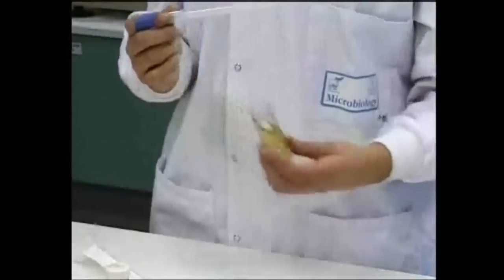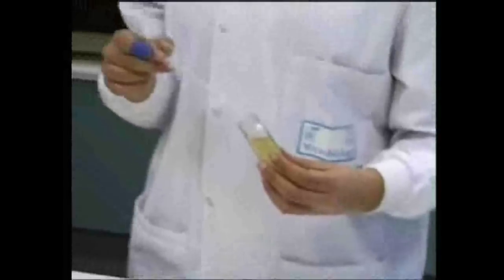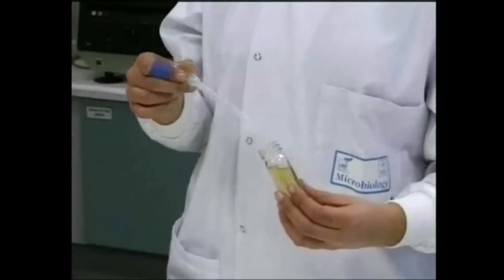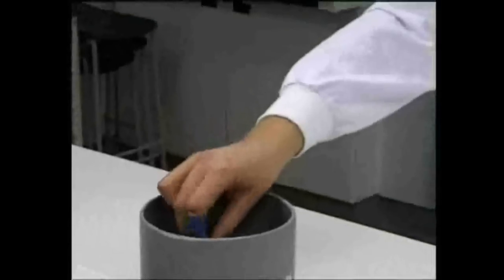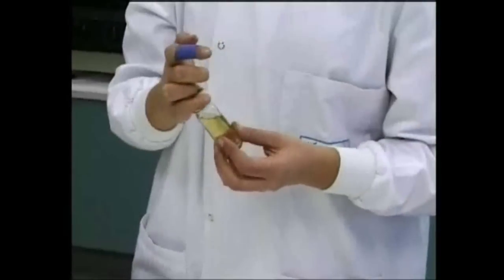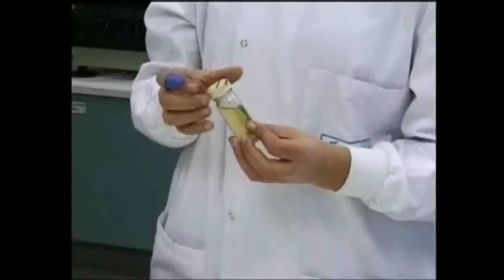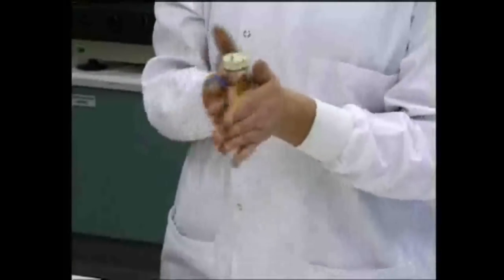The medium bottle is then opened and flamed and inoculated. The bottle is then reflamed, the top is replaced, and the pipette is disposed of. Then, to mix the culture and medium, the bottle is gently rotated in the palms. This prevents bubbles developing in the agar.